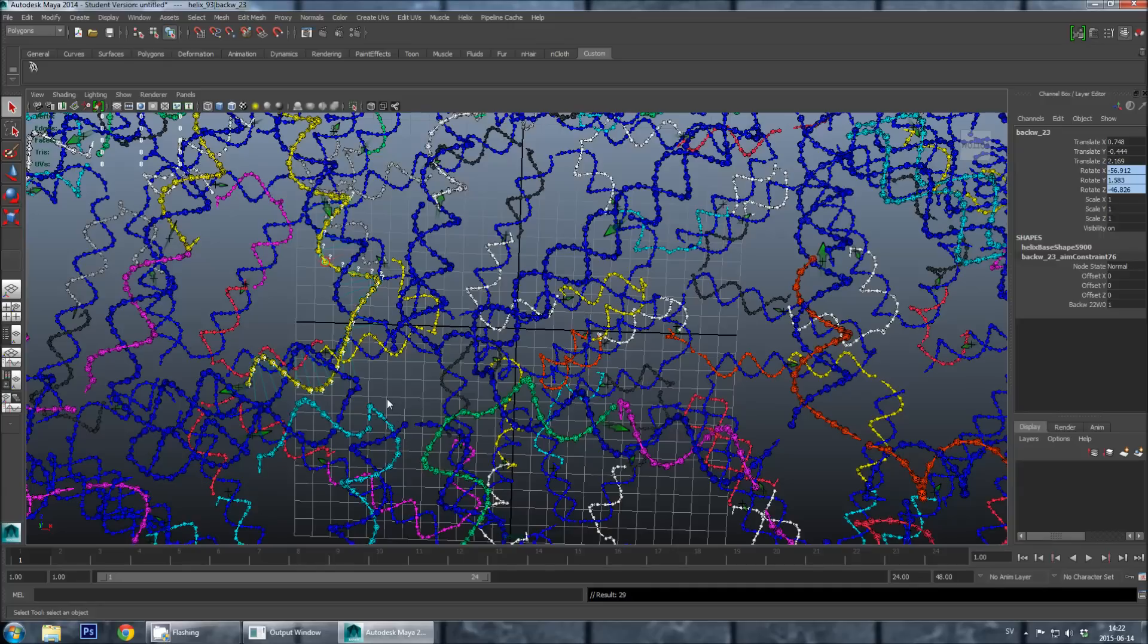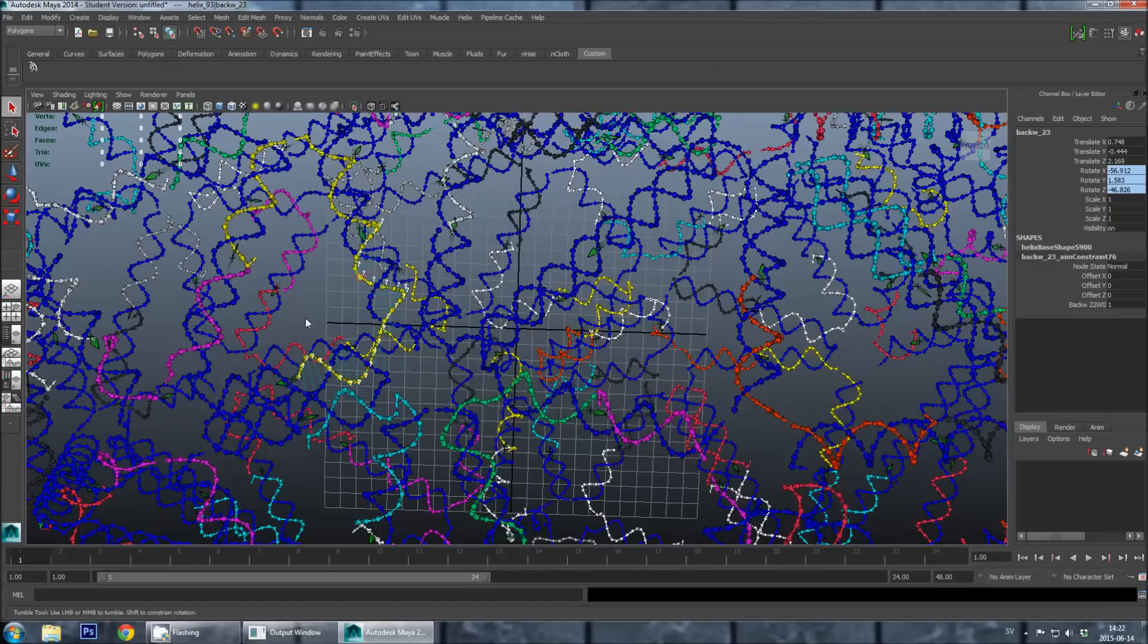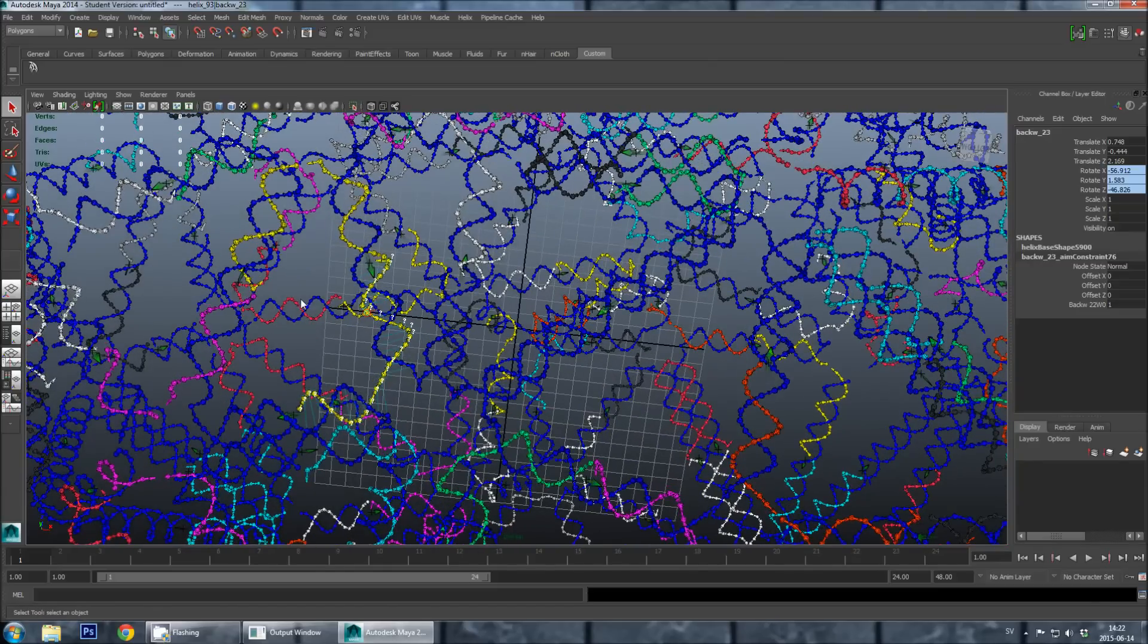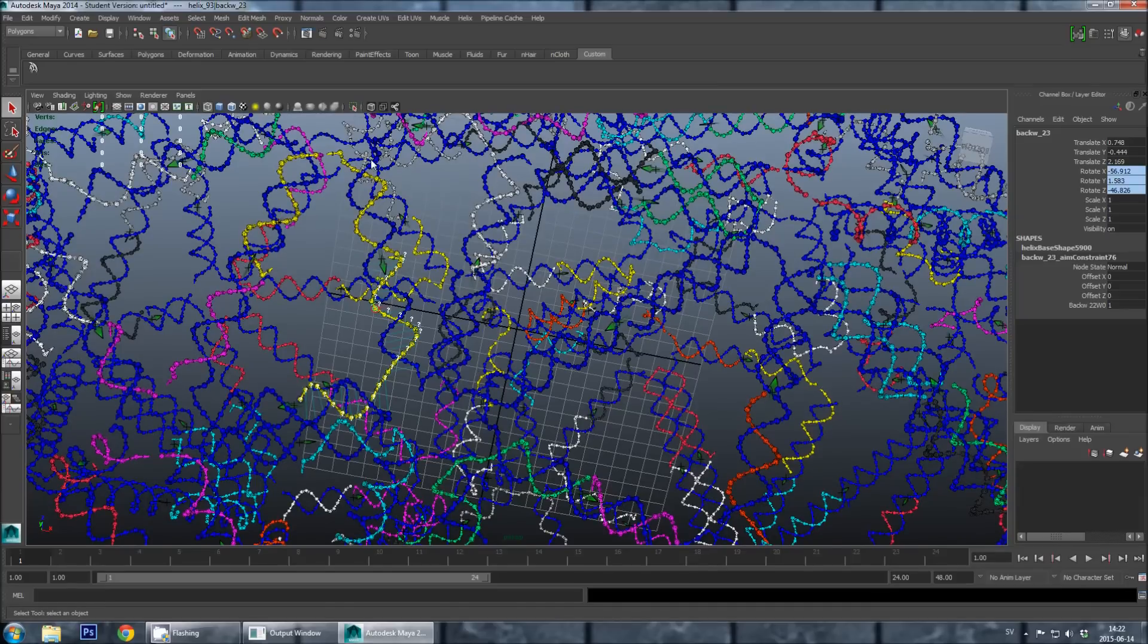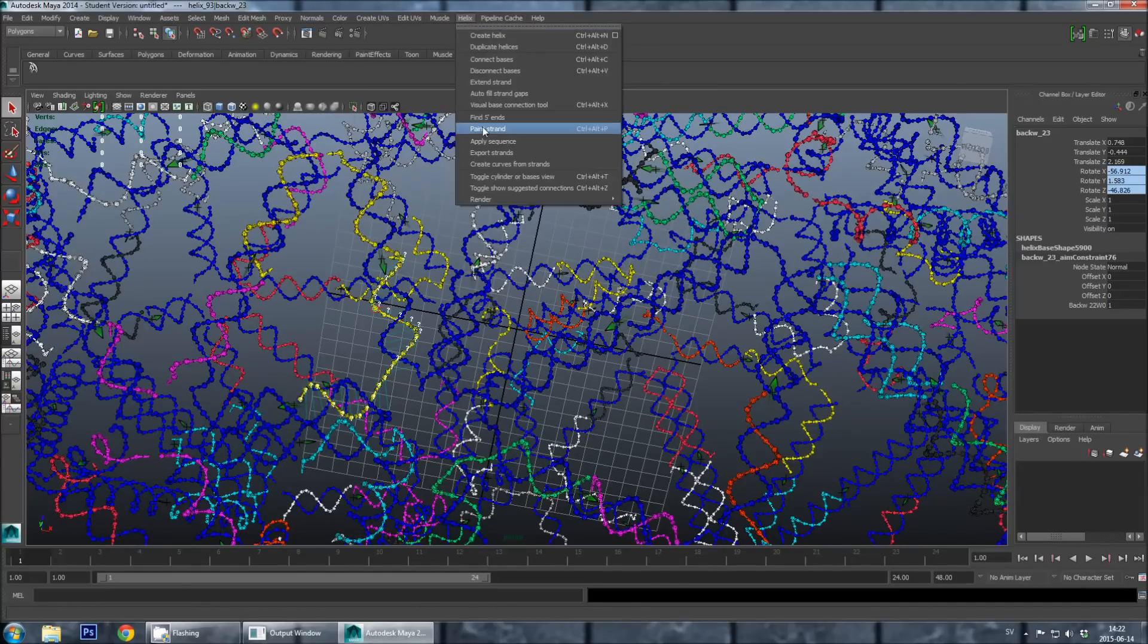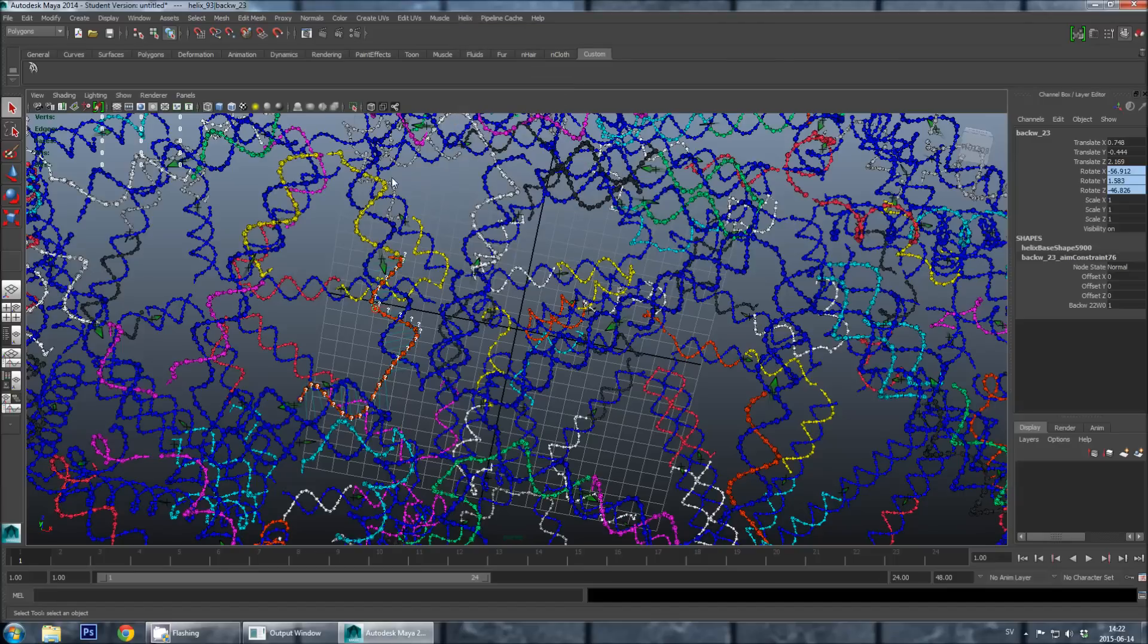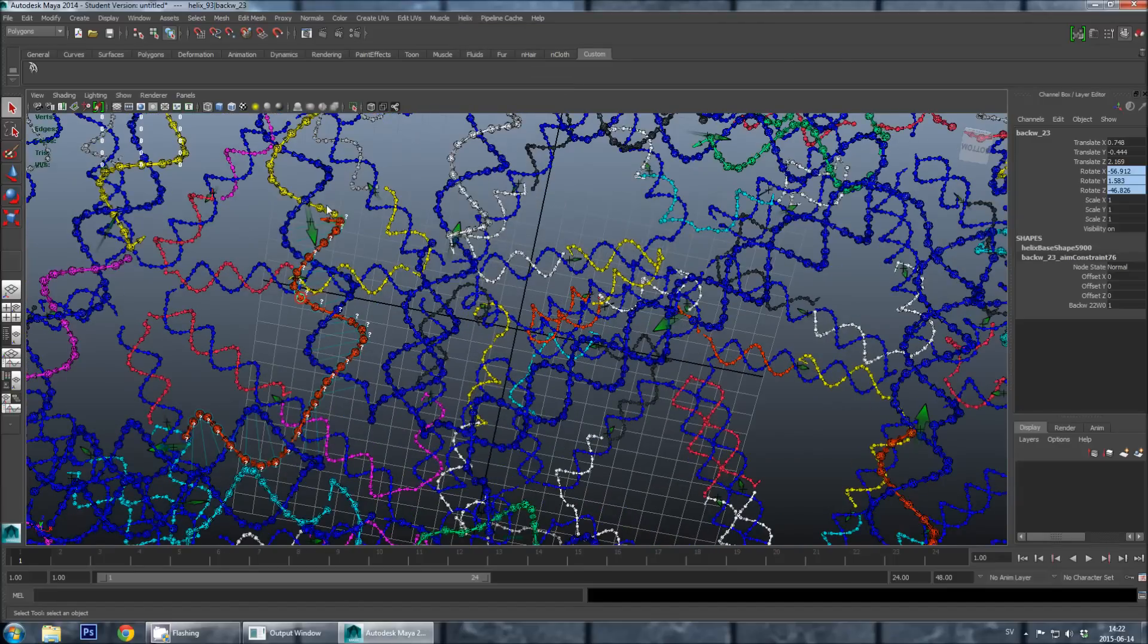Now we can start moving and deleting and adding breakpoints. So let's say that we want to remove the breakpoint between these two yellow staples here. I will just recolor this yellow staple. So between the red and yellow staple here.